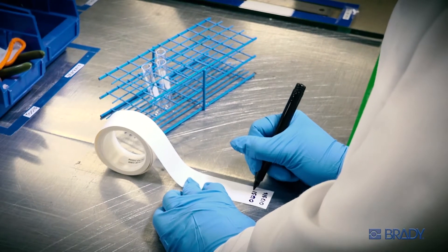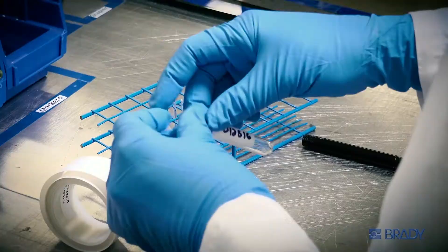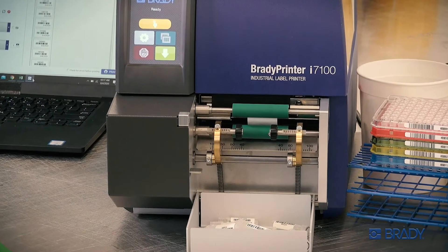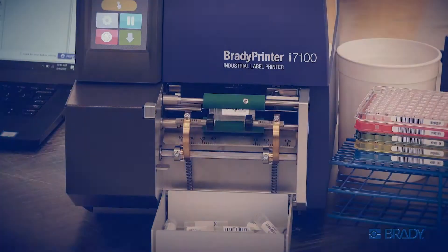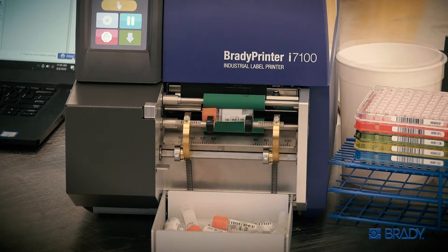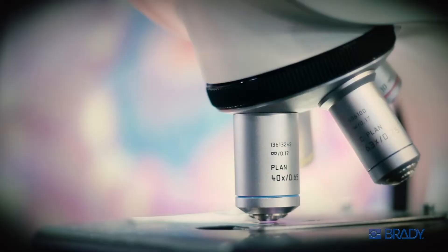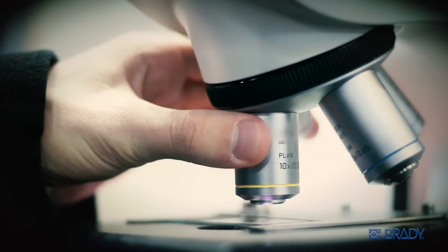Hand-applying labels can mean losing critical time and accuracy in your fast-paced lab. Ditch the inefficiencies. Attach the Vial Label Applicator to the Brady Printer I7100, and in just one easy step, you have accurate, easy-to-read labels that are automatically applied to a variety of vials and tubes. Now, your busy technicians can reduce labeling time and focus on more important tasks.